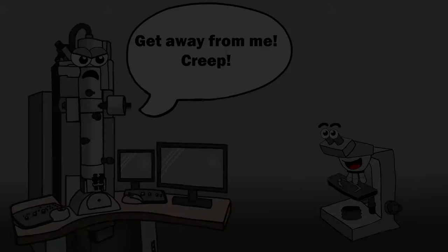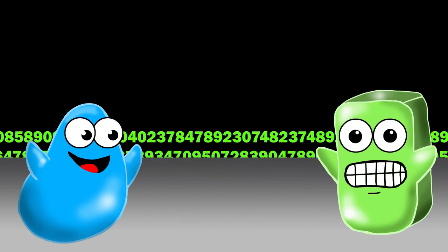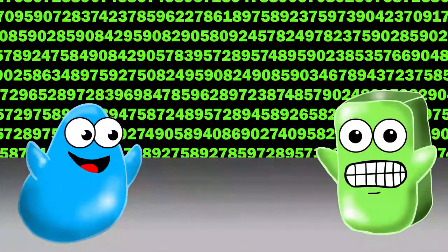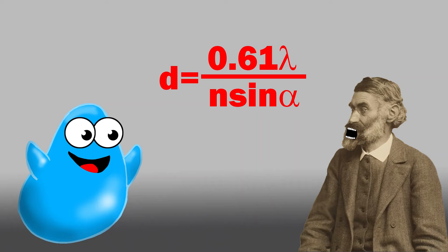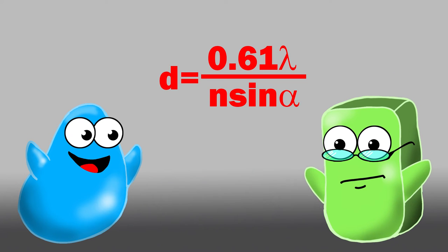To explain concepts like resolution, scientists like to use math. Oh, that sounds hard. It's not so hard, Annabelle. Let me explain. The way scientists define the resolution of a microscope is with something called Abbe's equation. Abbe's equation is used to calculate the size of the smallest object that can be resolved by a microscope.